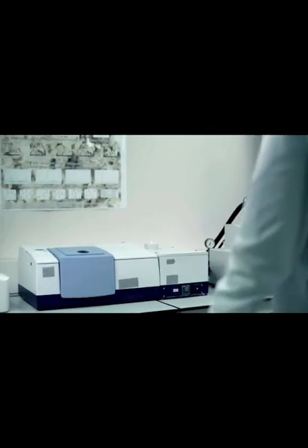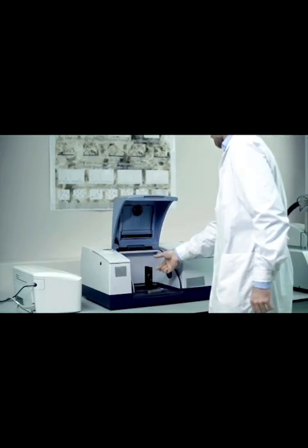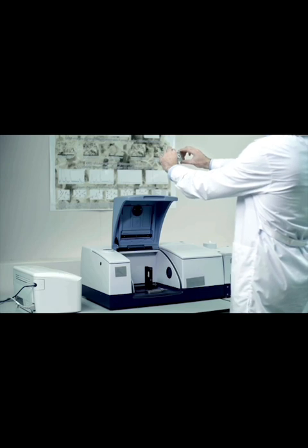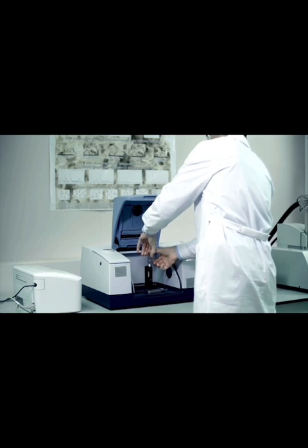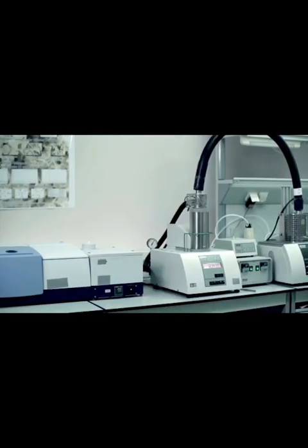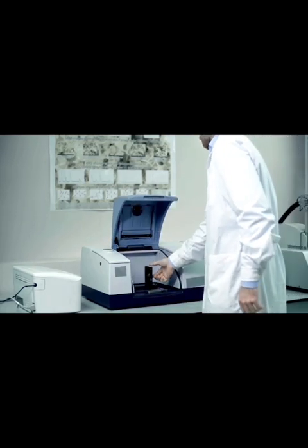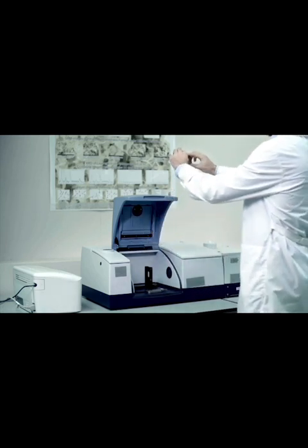Fourier transform infrared (FTIR) spectroscopy is a key tool in chemistry, biology, and environmental science for identifying and measuring chemicals in samples. It works by passing infrared light through a sample. Different chemicals absorb different wavelengths of this light, causing unique vibrations that create a specific pattern or spectrum. This spectrum tells us about the sample's molecular structure and the chemicals present. FTIR is versatile and can analyze solids, liquids, and gases with little preparation. It's non-destructive, so samples remain intact for further study.